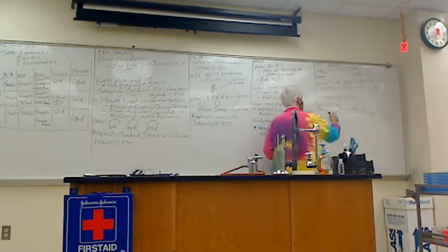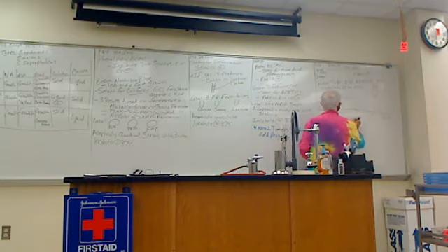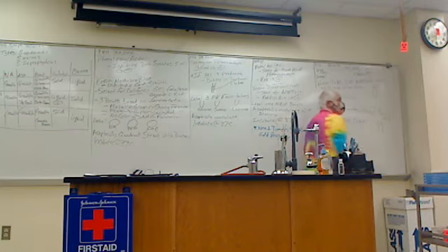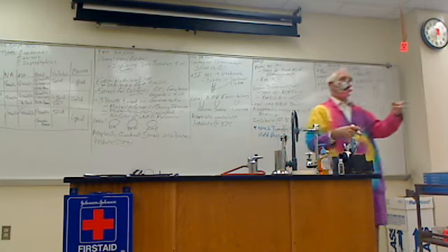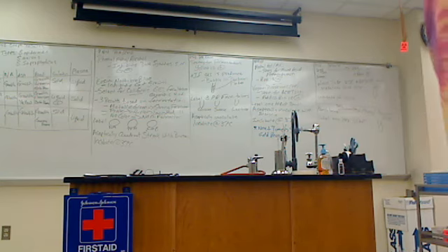So what you're going to do for this one is label 1 PAD slant. Now, when I say slant versus just like an agar tube, it's what you guys have been given, right? Like I've been giving you bacteria that are on that slant.